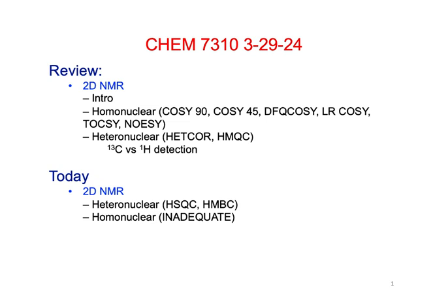All right, so last time we finished up the homonuclear experiments: the DQF, double quantum filtered COSY, the long range or relayed COSY, the TOCSY, total correlation spectroscopy, and the NOESY.